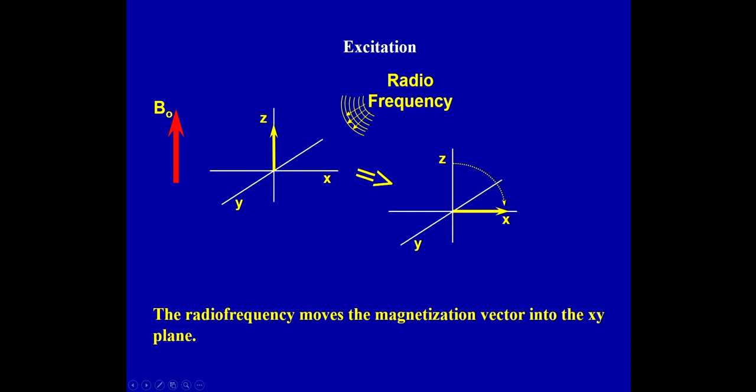As you've seen in the previous lectures, in the presence of a strong magnetic field, which is called in NMR jargon B0, one of the consequences in a set of spins, a sample that has nuclei with spin, is that we develop a net magnetization. It's possible, in the presence of a radio frequency, if we adjust the right frequency, called the Larmor frequency, if we apply an oscillating magnetic field called B1 at that frequency, we can cause this net magnetization to rotate.